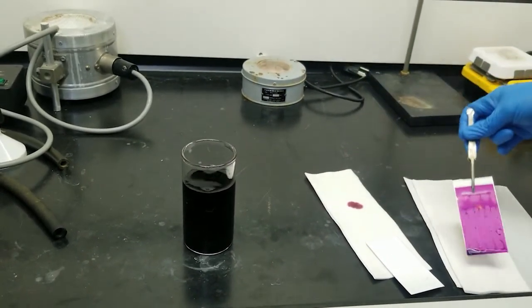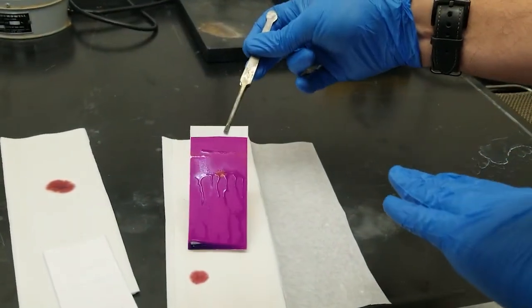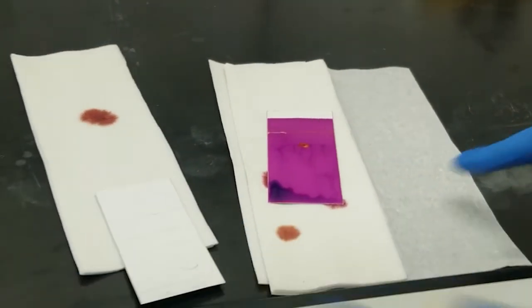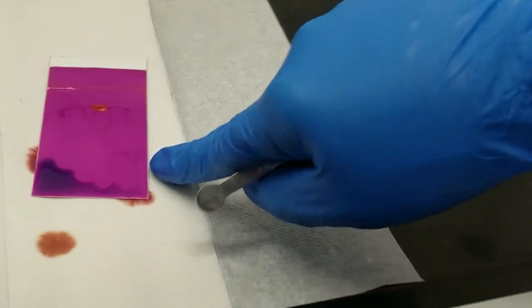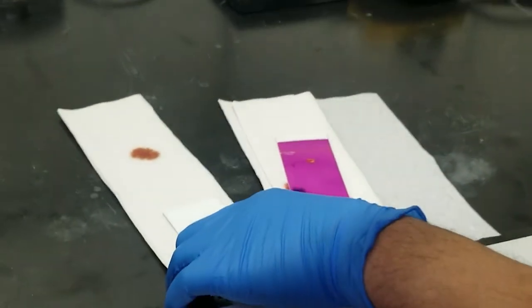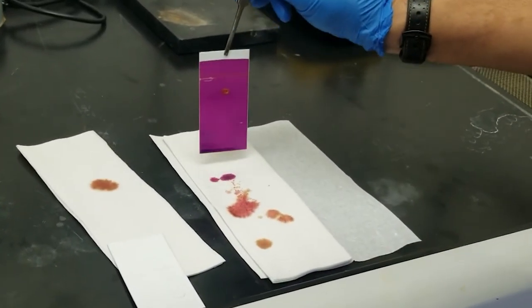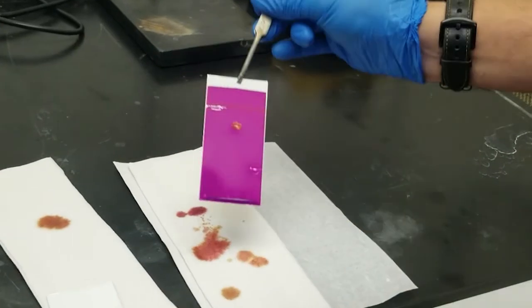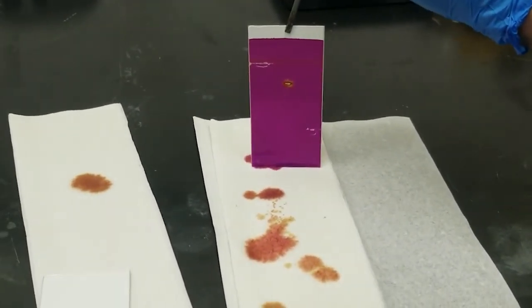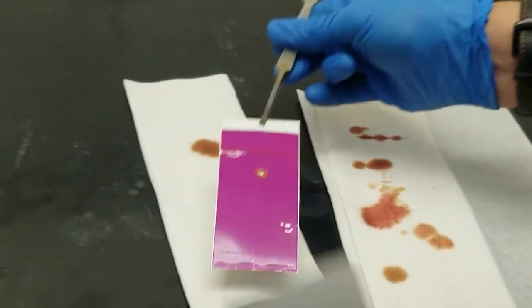And we can already see one of the spots developing there. So here we're looking for discoloration. Brown colors are spots here. Yeah, one more popping up over here. They should be in the exact same spots that they were under the UV light. I got too much permanganate on there. Let me get a little bit of it off. We can also see it oxidized in the paper towel there. Yeah, that one there is showing up really nicely.